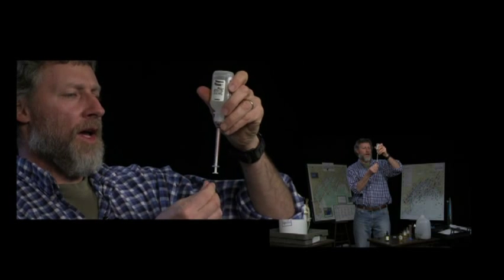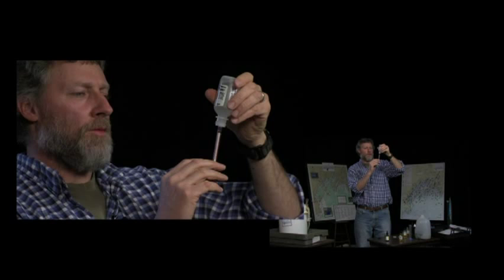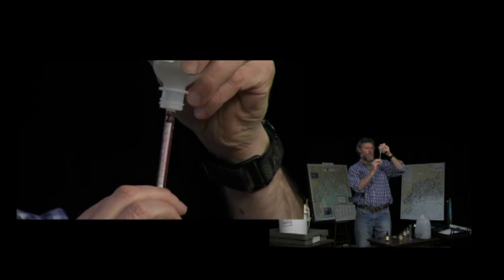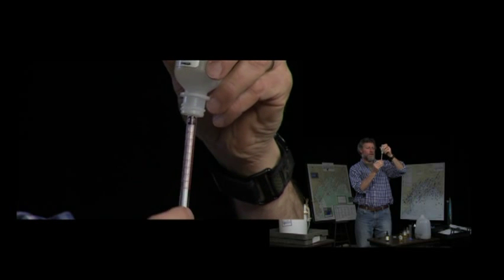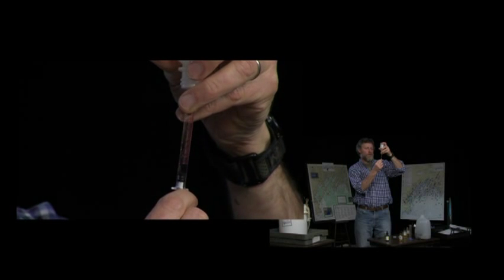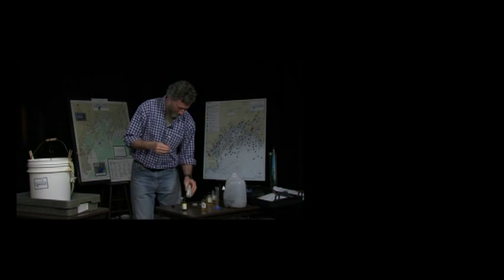Pull it down. Maybe about a 1/2 inch or so is good. Again, you're going to probably have a bubble in there, so we'll just kind of push that up and down a little bit, and then pull it down as far as you dare. Flip it upright.